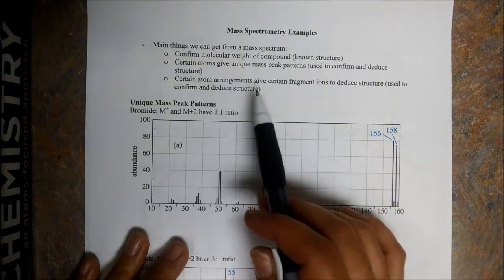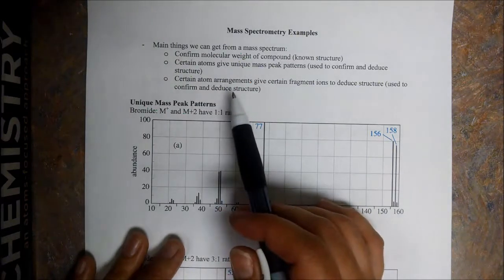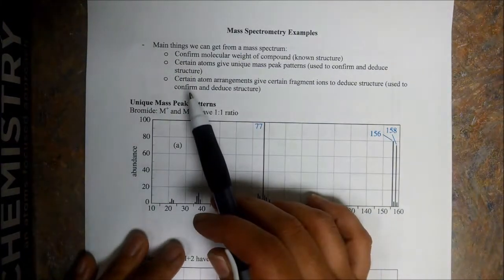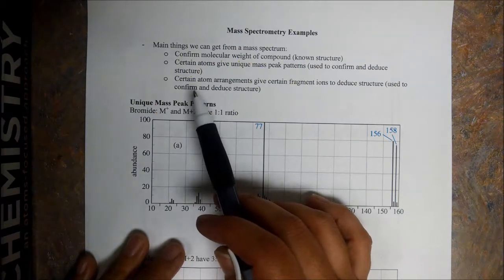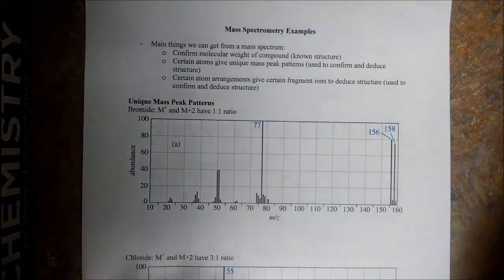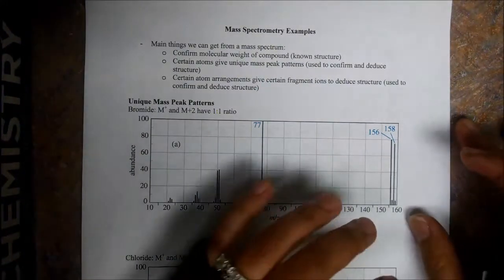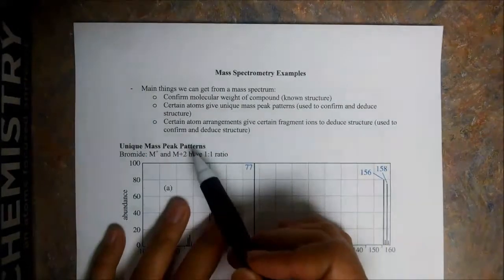Okay, so certain atom arrangements give certain fragment ions, and again we can use this to confirm or deduce our structure. So again, if our compound should have these things in it, then it should be present in the mass spec. Or if we have an unknown, we can use these mass arrangements to deduce the structure of the unknown compound. Alright, so first up, these unique mass peak patterns.